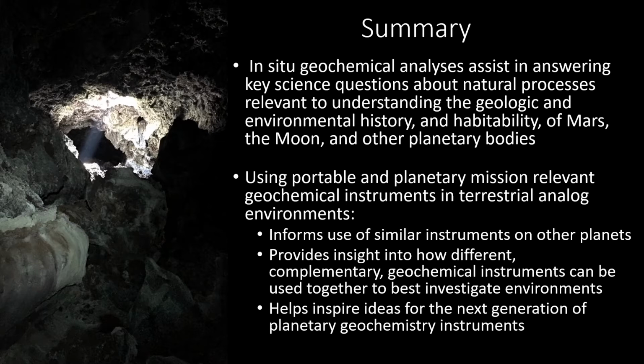Using portable and planetary mission-relevant geochemical instruments in analog environments informs the use of similar instruments on other planets, provides insight into how to best use complementary geochemical instruments to investigate these environments. And it also helps inspire ideas for the next generation of planetary geochemistry instruments.